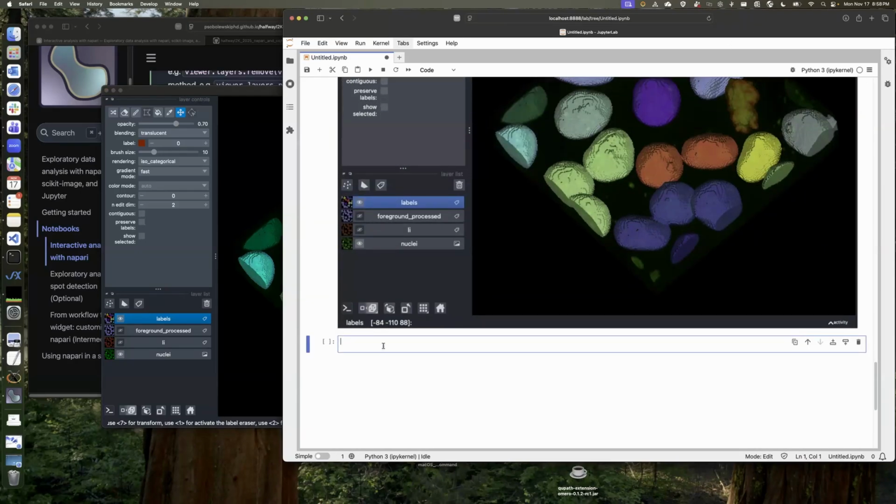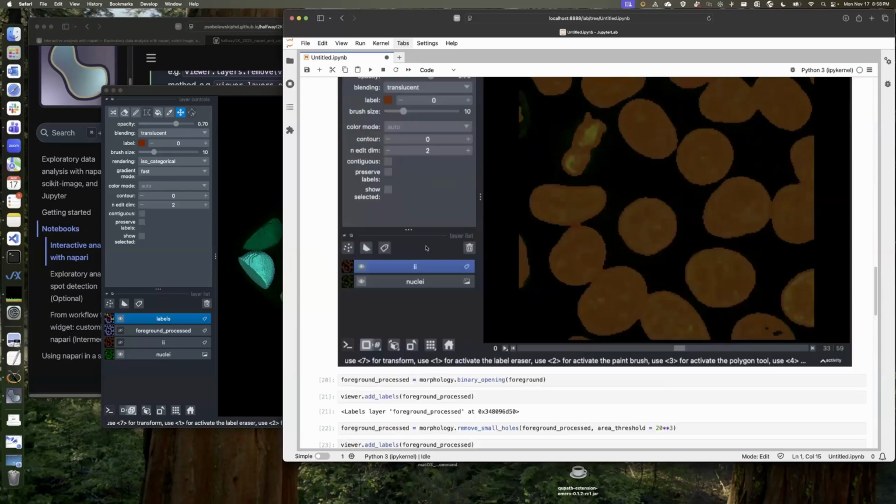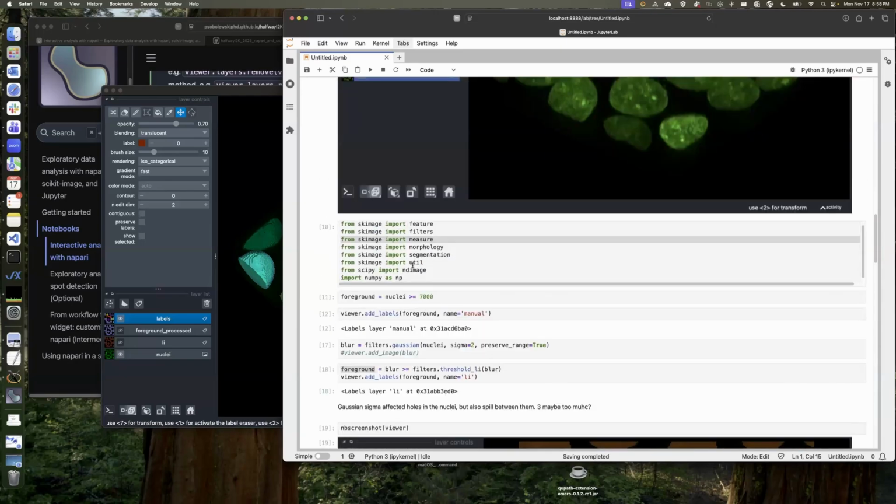And so we can do distance equals. In this case, this is a function, I'll just go back up here for a moment. ndimage is from SciPy. SciPy is another numerical library for doing all sorts of data analysis, and it includes this very handy module called ndimage.